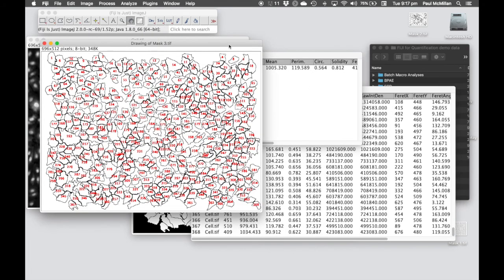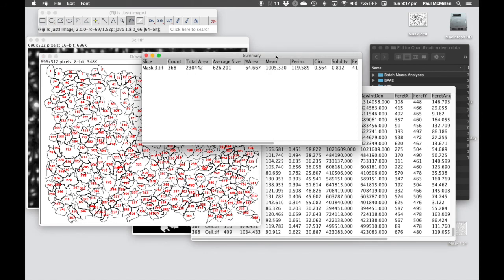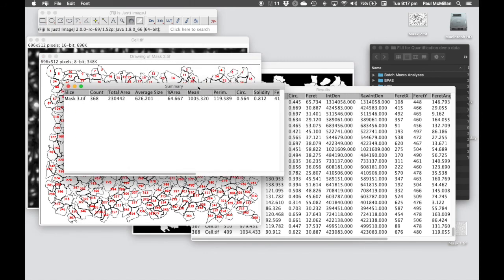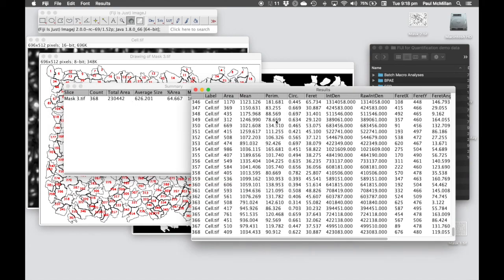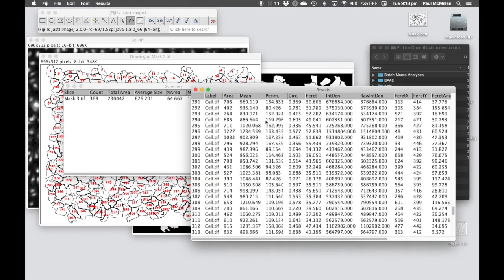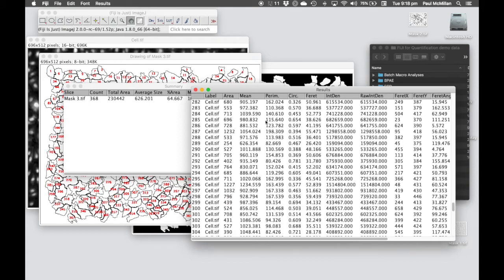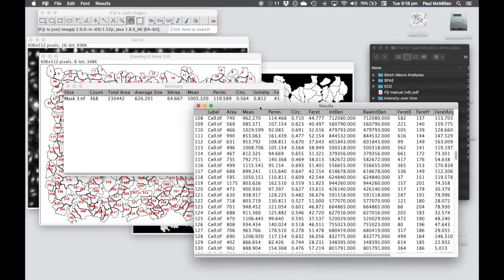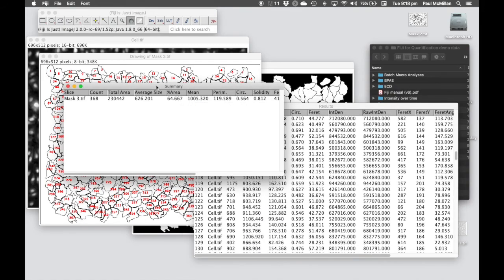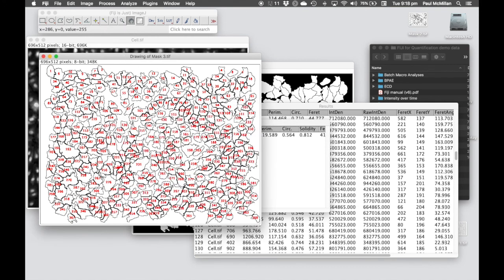Now we've got our Outlines showing all of the cells that have been identified. Our Summary showing that there's 368 cells and these are the total or average statistics. And then also you have those measurements for each of those 368 cells. You can save both the tables as a CSV file and the Outlines as a TIF file.